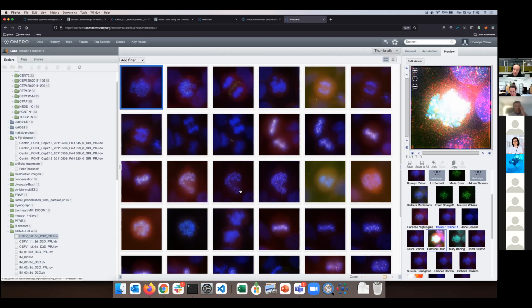Okay, the training server has the same sets of images for each of you, dear scientists, colleagues in the same group. But this is an untypical situation because this is a training. In real life on the Finnish server, of course, each of you will have your own images, which are basically reflecting the science you are doing, which is definitely different than your neighbor in the office. But for the training server, I have to work with a homogeneous set of images so that you don't get confused, which is of course the highest danger here.